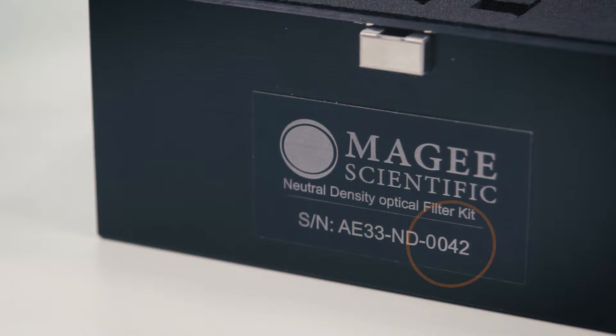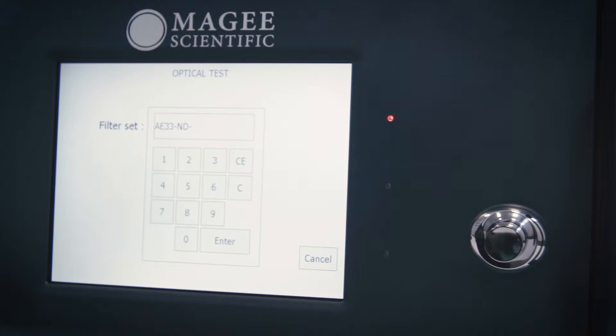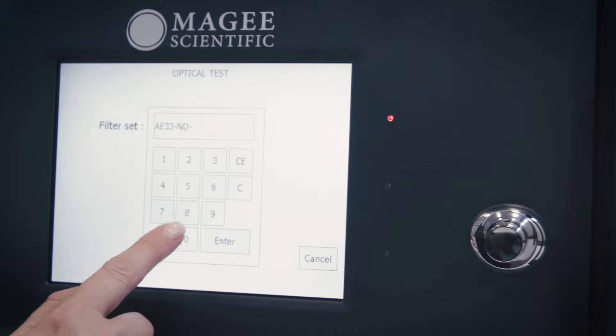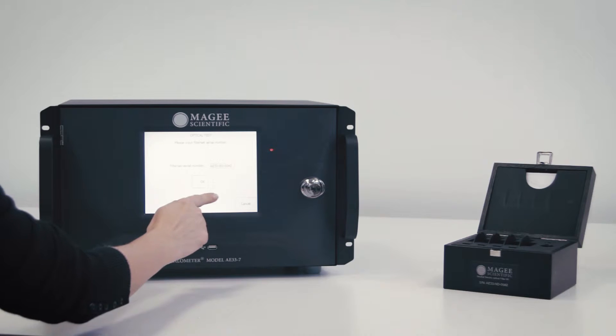A new screen appears asking you for the ND Kit serial number. Press the input box field and enter the serial number of the ND Kit. Confirm by pressing the Enter and OK buttons.